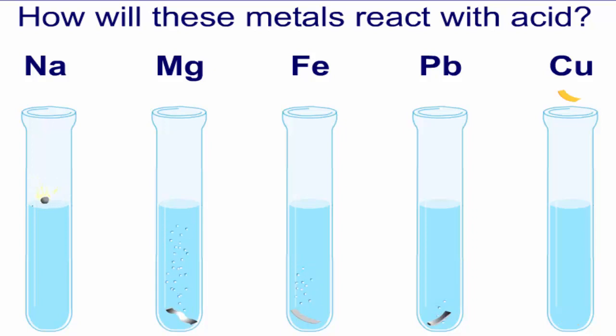The last one is copper. What happens when copper goes in there? Absolutely nothing. Okay, so you can see that the sodium is very reactive, followed by the magnesium, the iron, the lead, and finally the copper is not reactive at all.